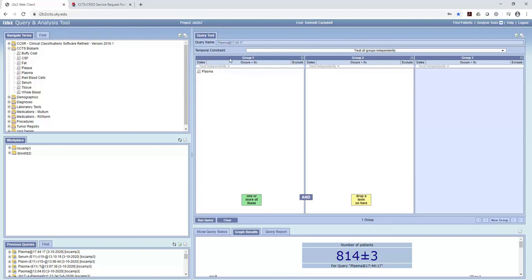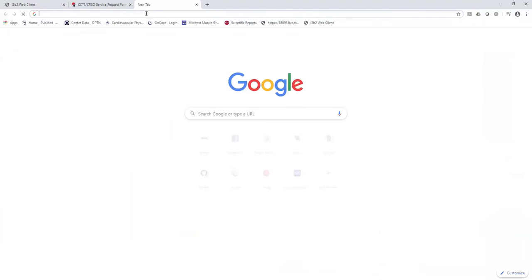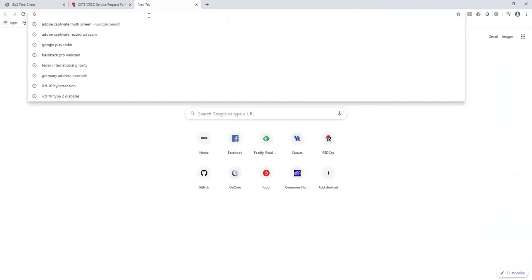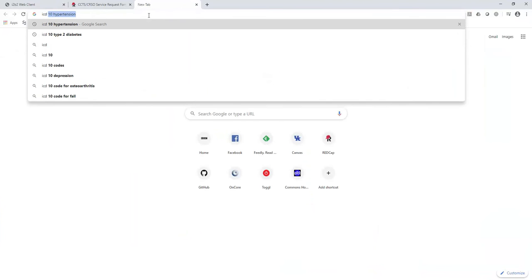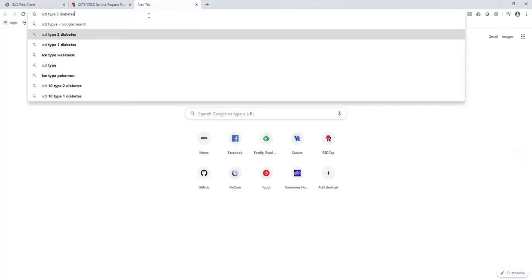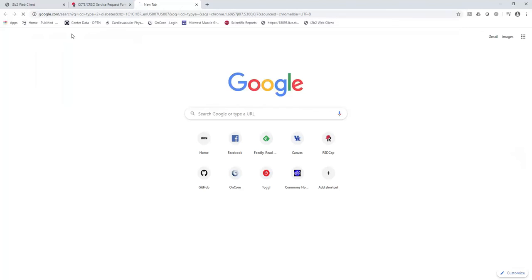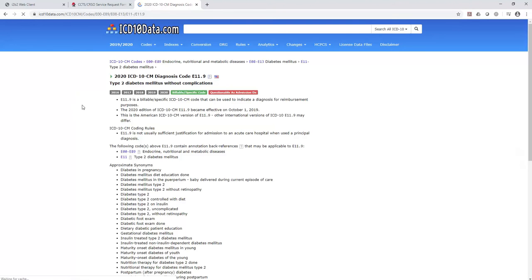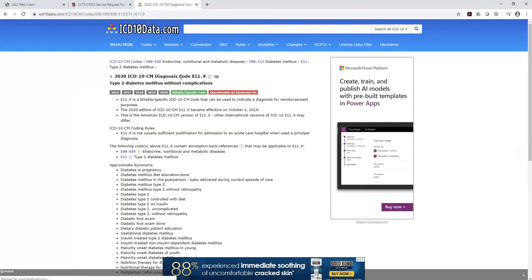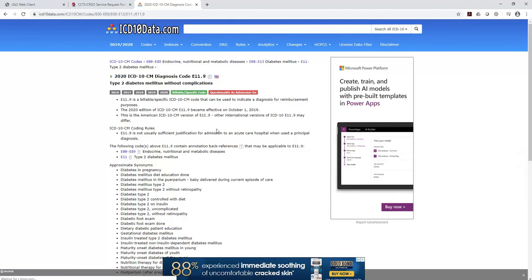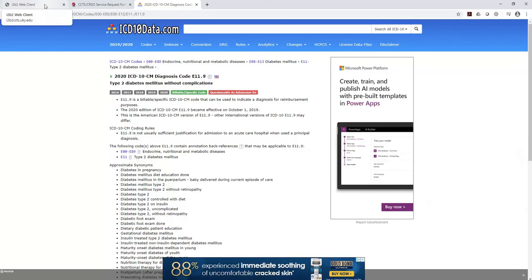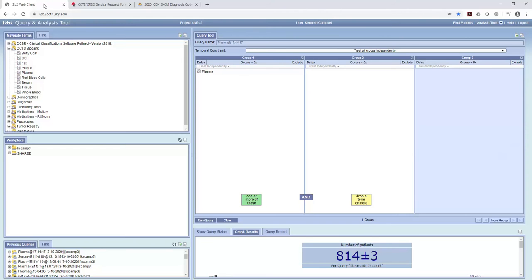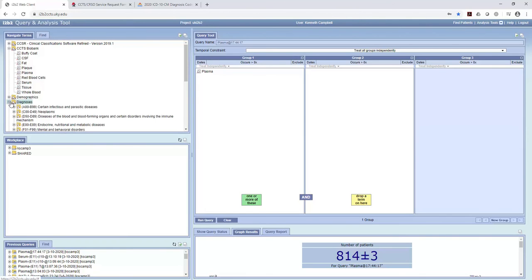Now I want to see how many people we have plasma from who also have diabetes type 2. So the easiest way to search for that is to use what are called ICD codes. So I'm going to go ICD type 2 diabetes. And here I'm going to get some information on ICD type 2 diabetes. So if I click on that, E11.9 is a code for diabetes mellitus.